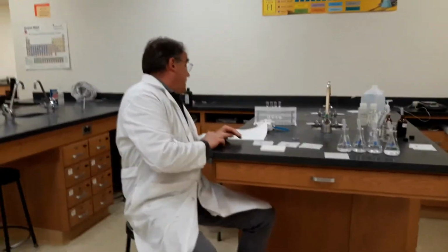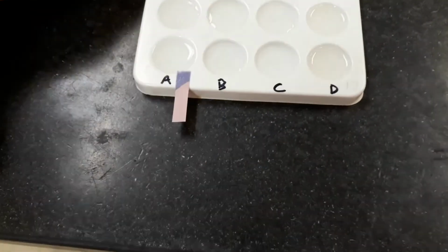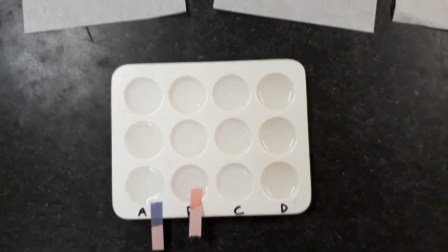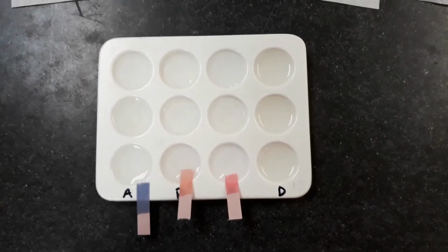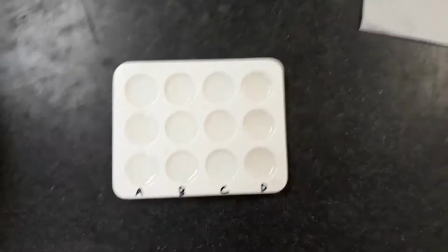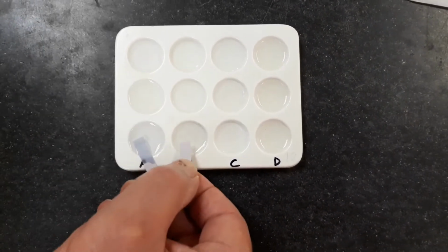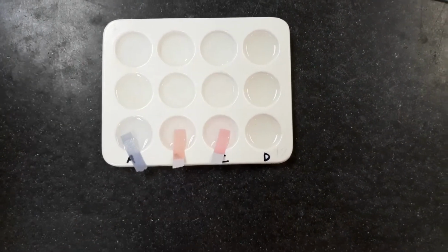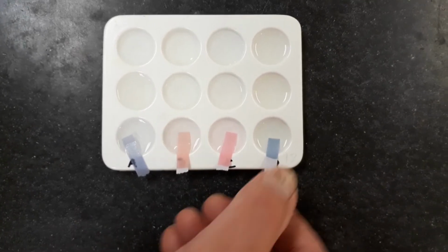So first is red litmus, and here we have red litmus turning blue in substance A, staying red in substance B, dark red in substance C, and blue in substance D. And then for blue litmus, blue in substance A, red in substance B, darker red in substance C, and darker blue in substance D.